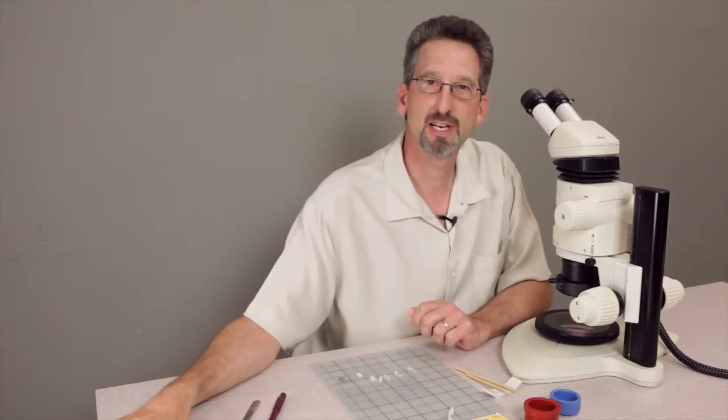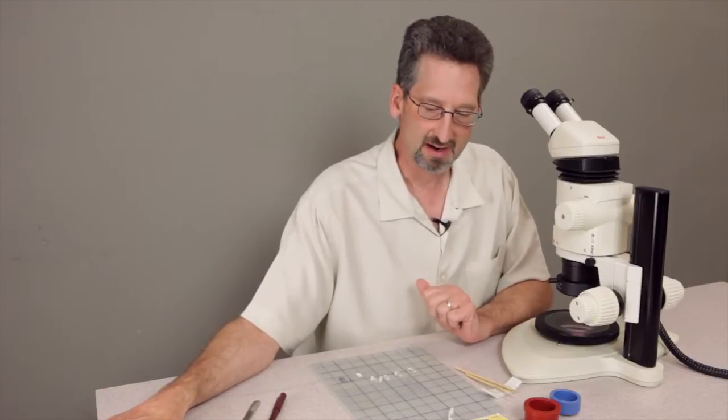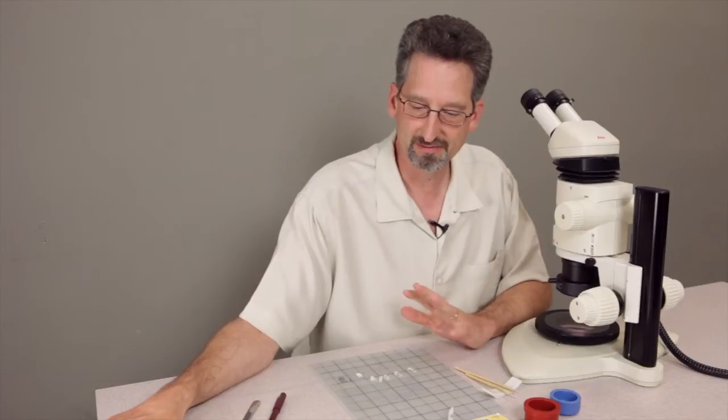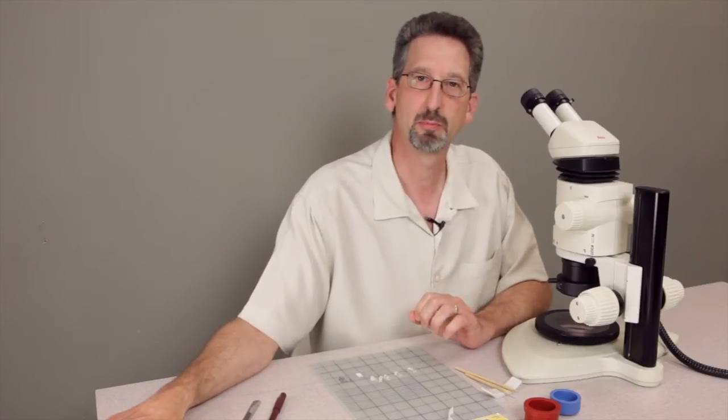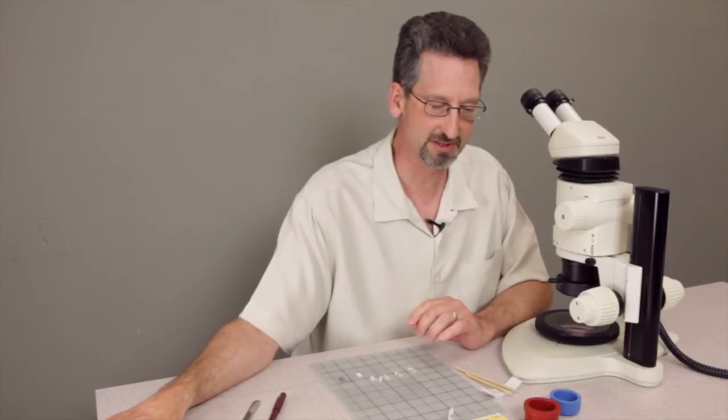Hi, my name is Mel Wachowiak and I'm a senior conservator here at the Museum Conservation Institute. I wanted to share a few ideas about sample preparation that have worked for me over a number of years.